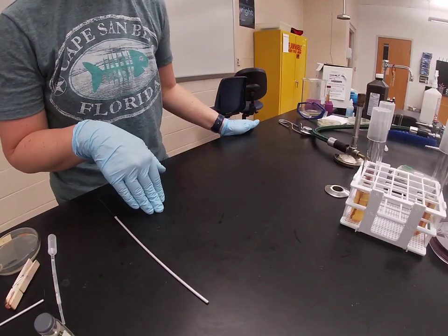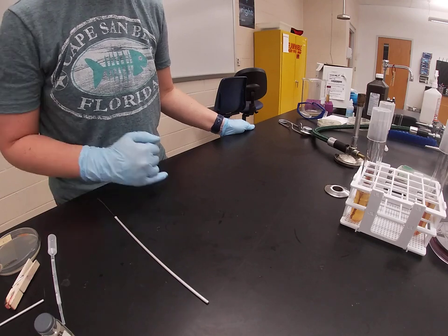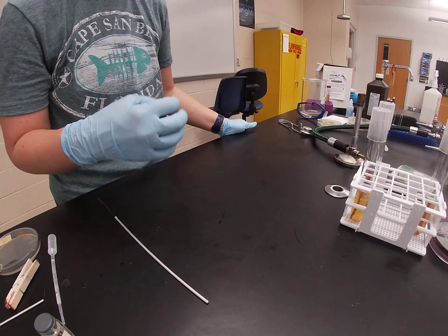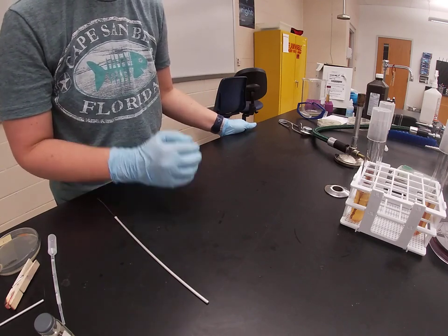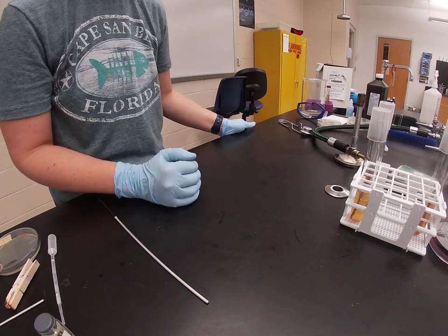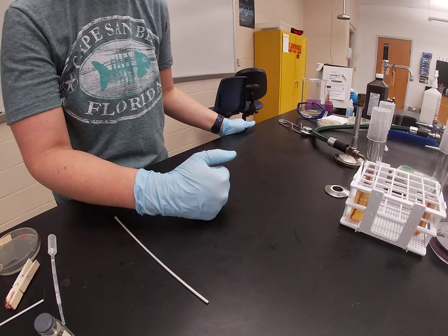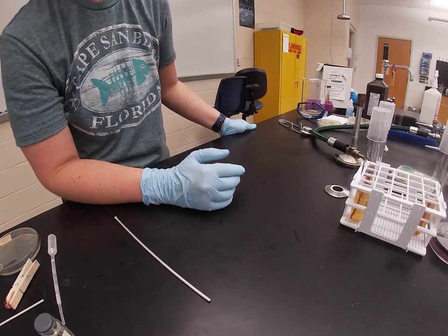In this video, we are going to discuss the use of the motility agar in the motility test. When we talk about motility, we are talking about the ability of the bacteria to actually move away from their initial site of inoculation. So when you just spot inoculate bacteria into a plate or into a medium, if they have flagella, they can sometimes move away from that initial site. And that's what we can test with this motility agar.